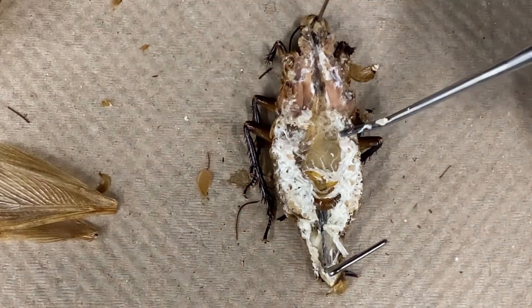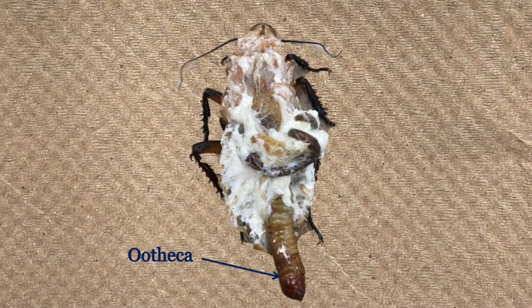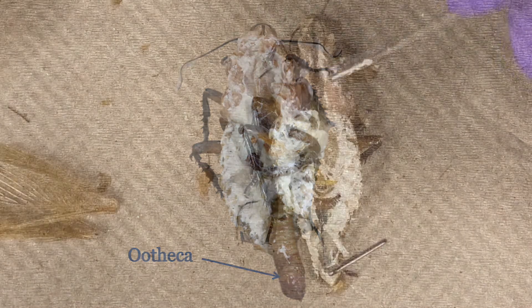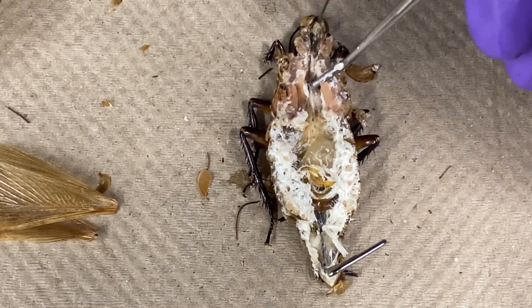The whitish matter surrounding the gut is the fat body. If it is a female cockroach, you may see the ootheca containing yellowish eggs in the abdominal cavity. Before removing the fat body, it is best to locate the other structures so as not to damage any organs.